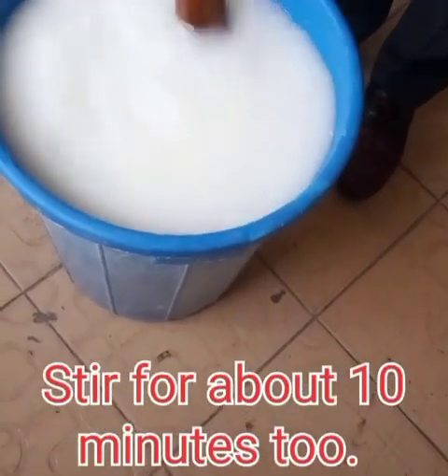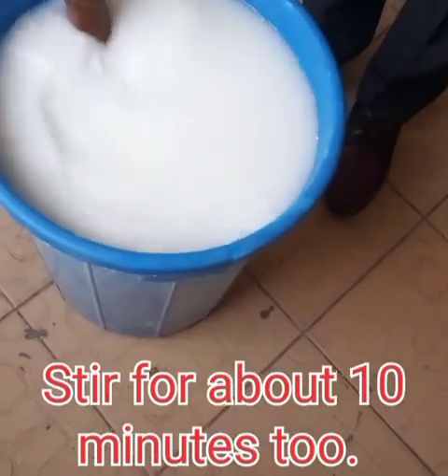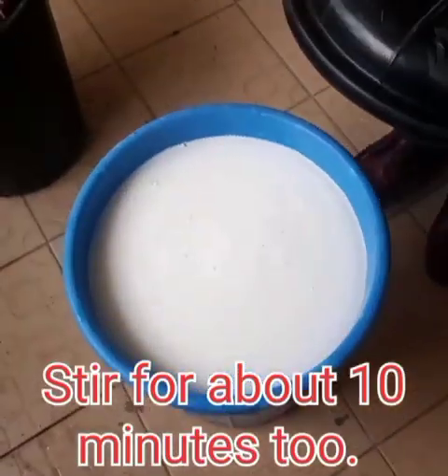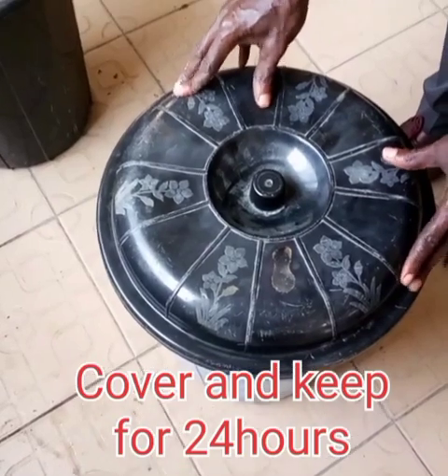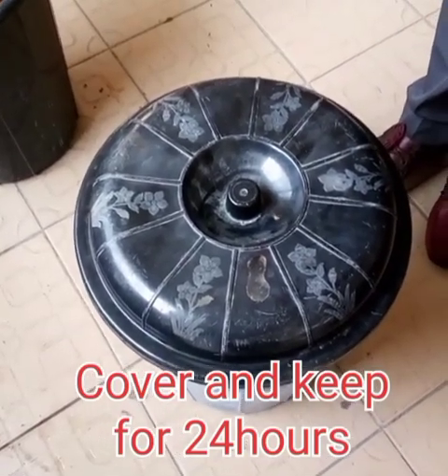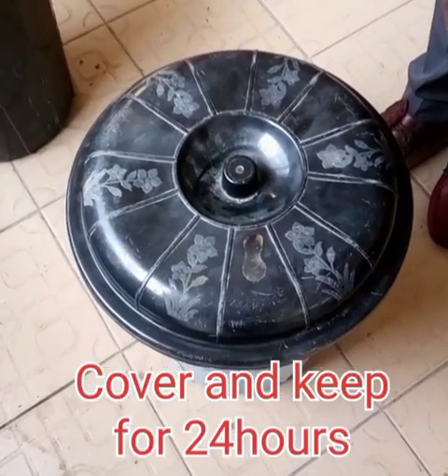Stir it. And then you cover it, and allow it to stand for about 24 hours before you filter it.